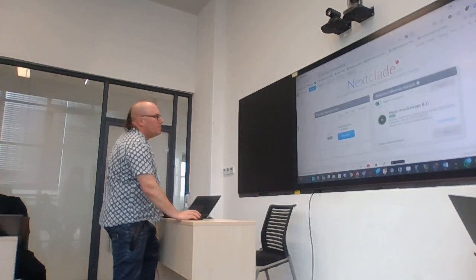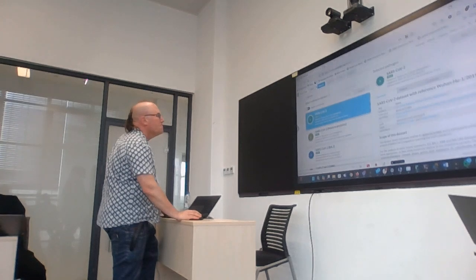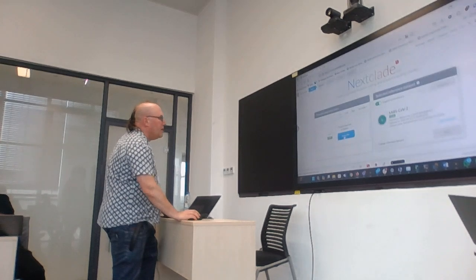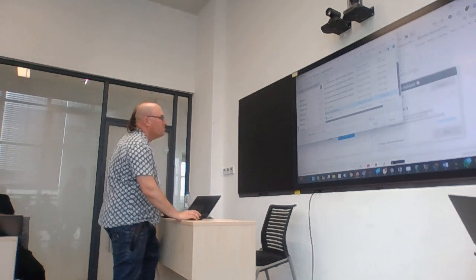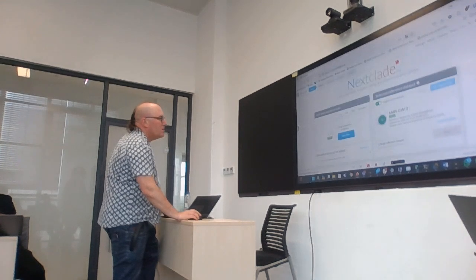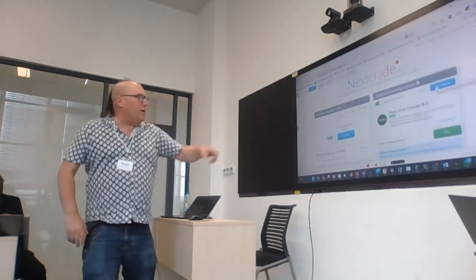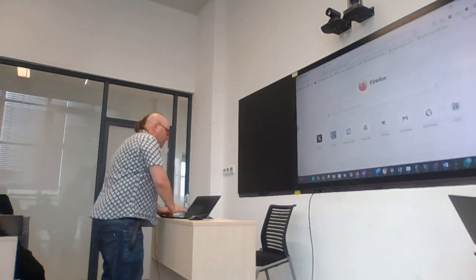I'm going to again make a change reference dataset. I'm going to make this SARS-CoV-2. I'm going to switch this to that. And then I'm going to say resuggest. If I click resuggest, it chooses one. And by the way, this is Mpox lineage B.1. Just to illustrate again what we're dealing with.